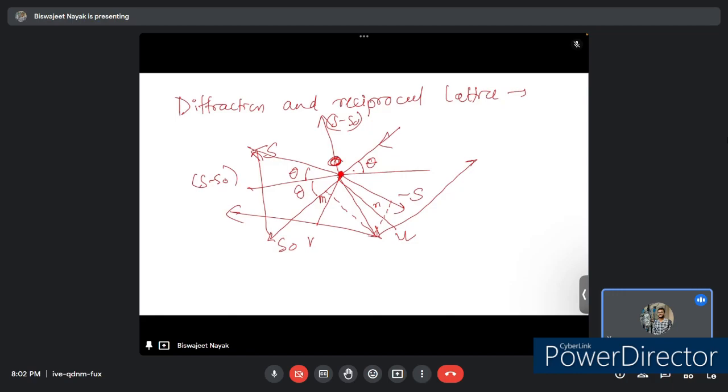So we consider how this X-ray is scattered by the atom at O, and how it is scattered by any other atom A present, whose coordinates are given by, let's say, p a1, q a2 and r a3.